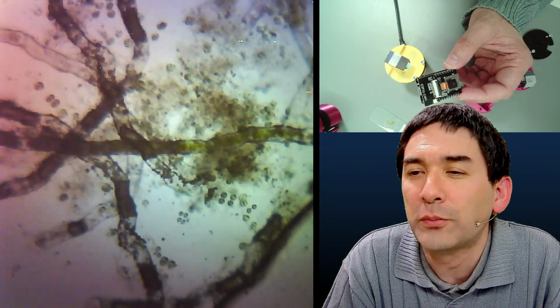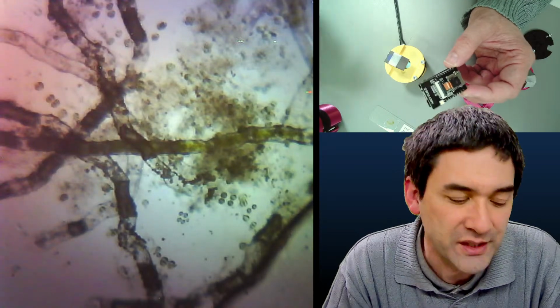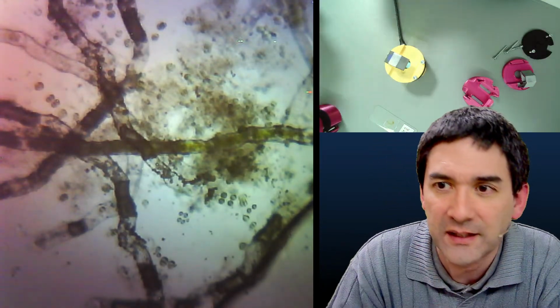It's sad to see microplastics in water samples. Honestly, I find them quite a lot. So if I put in a water sample from somewhere, sooner or later, I'll always find some plastic textile fibers.